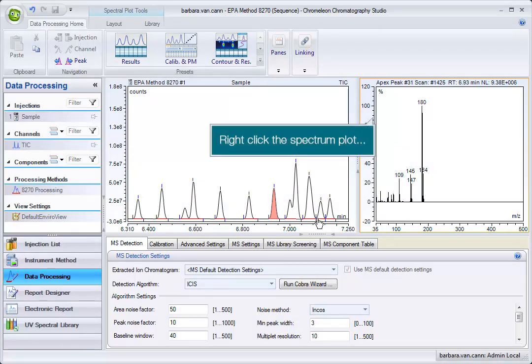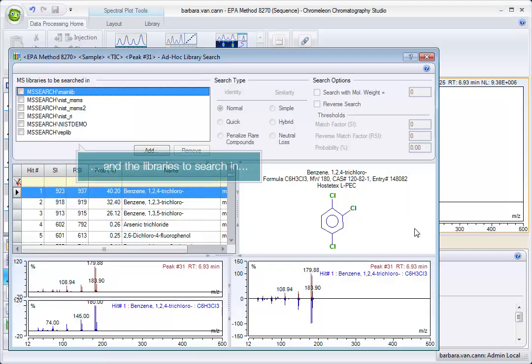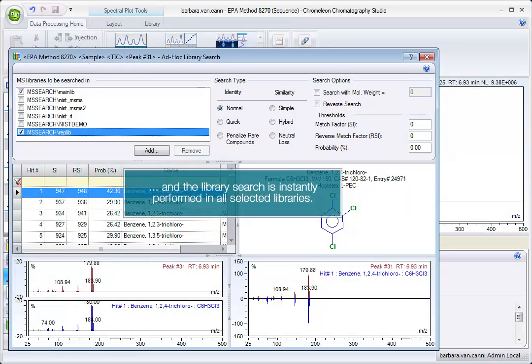Right-click the spectrum plot and select Find in Library, and the libraries to search in. The library search is instantly performed in all selected libraries.